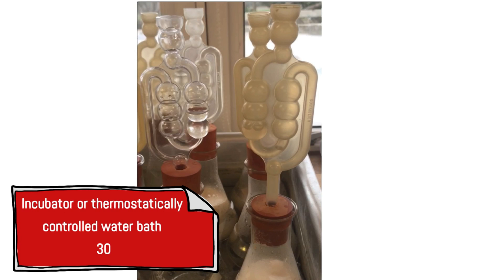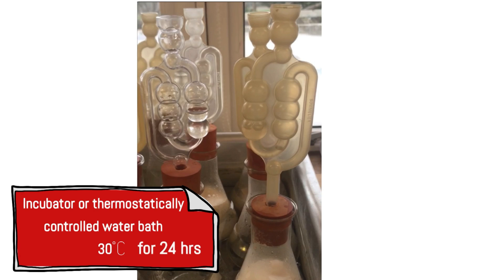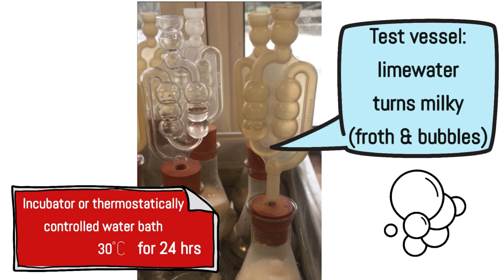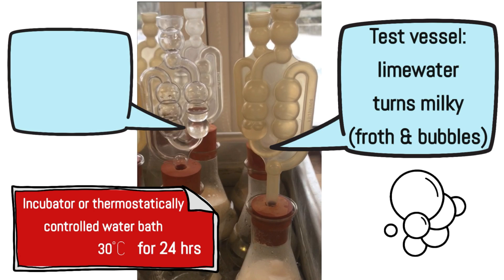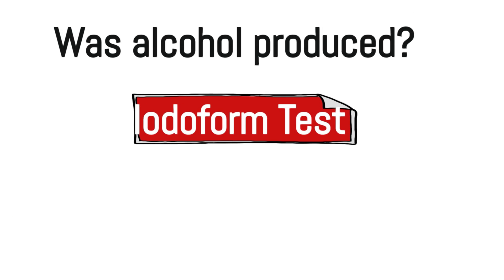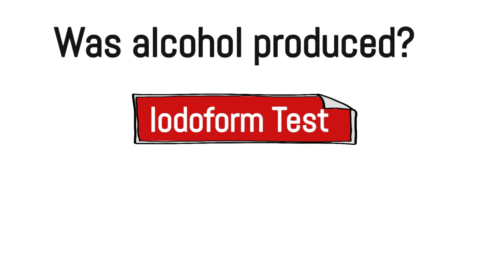Both flasks were placed in an incubator or thermostatically controlled water bath at 30°C for 24 hours. In the test flask, bubbles appeared in the lime water and a froth eventually formed, showing anaerobic respiration was taking place. In the control vessel, no bubbles occurred and the lime water stayed clear. After 24 hours, the iodoform test was performed to check whether alcohol was produced.